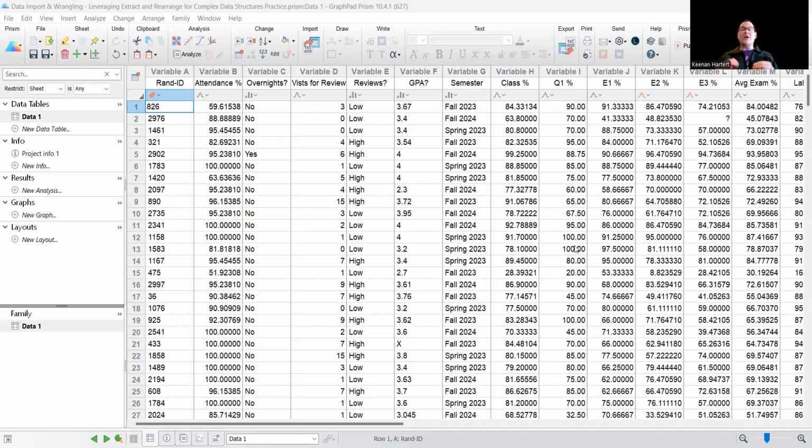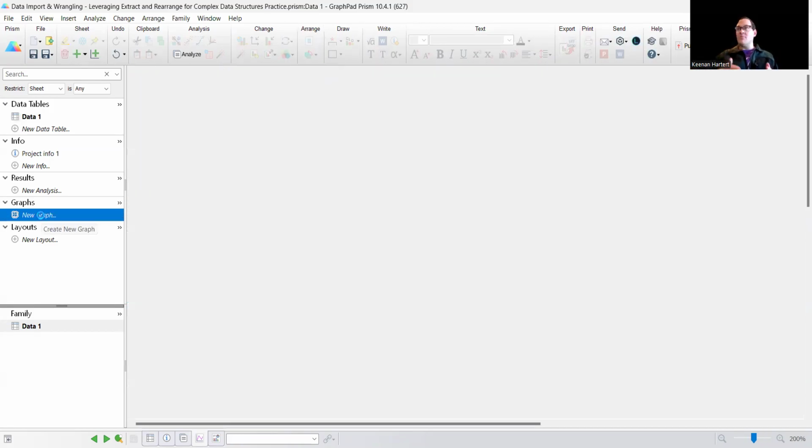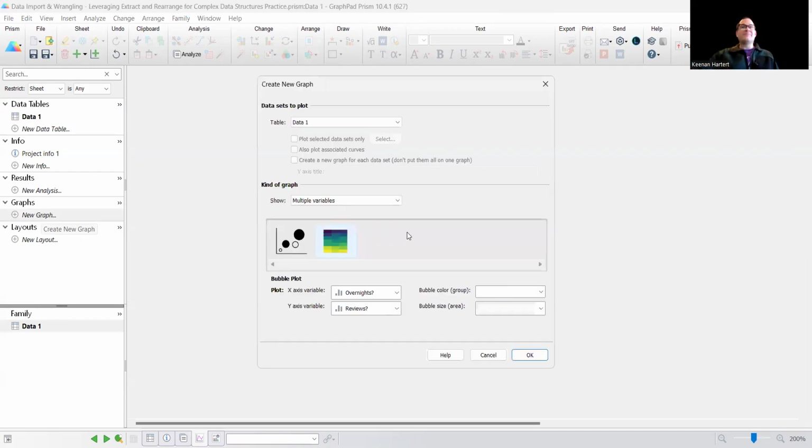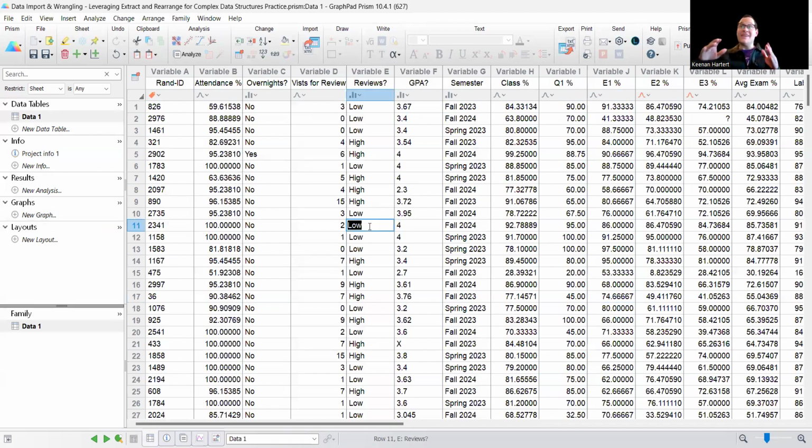This is going to save you all kinds of time because you can go from this big mothership of data right here and do the advanced analyses that we've seen already, where you can make, for example, these great XY color and size graphs, heat maps, things like that. Perfect. But if you wanted to do sub-analyses of the data that you already have, there's a way to do that instead of just making a ton of files like I kind of used to make even.